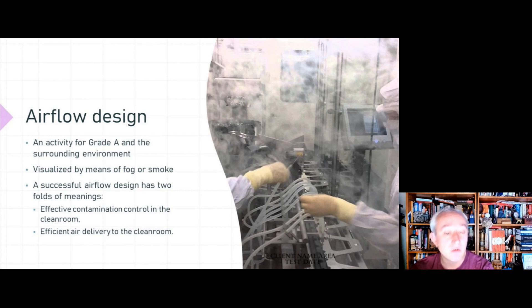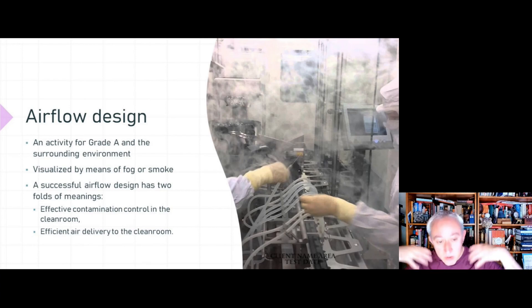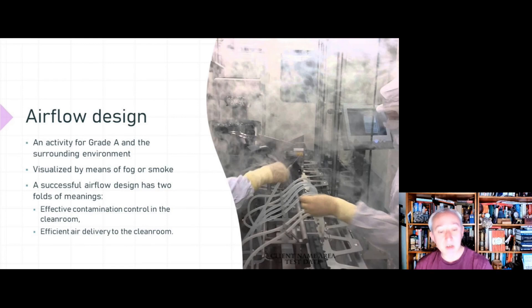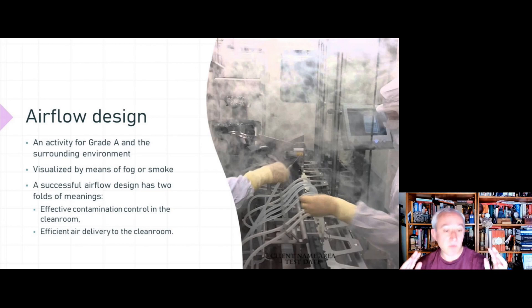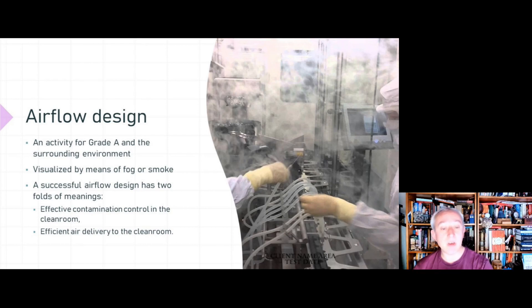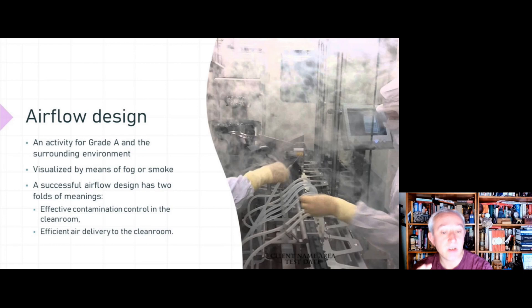To maintain effective contamination control for a particular clean room, we want to have a large quantity of air flowing in a direction that helps to maintain contamination control. Within Grade A or ISO class 5, that's a unidirectional airflow, so this feeds into the previous video.